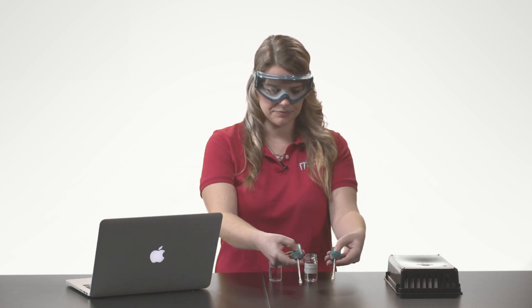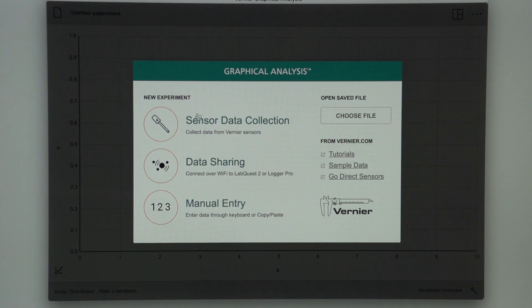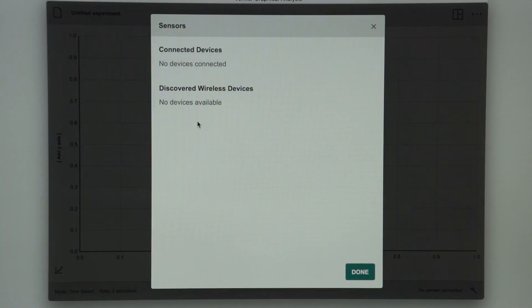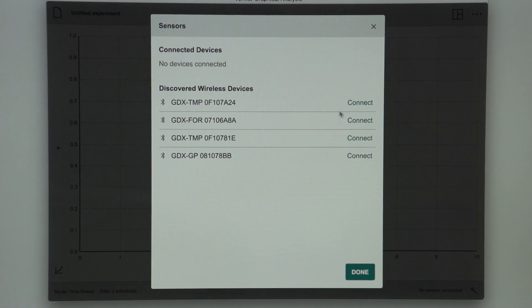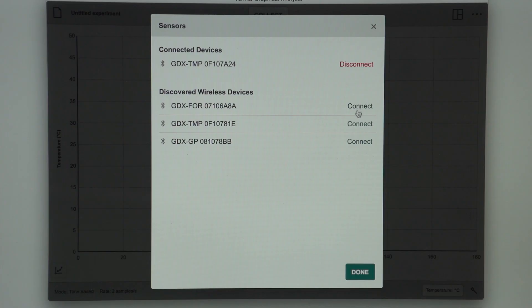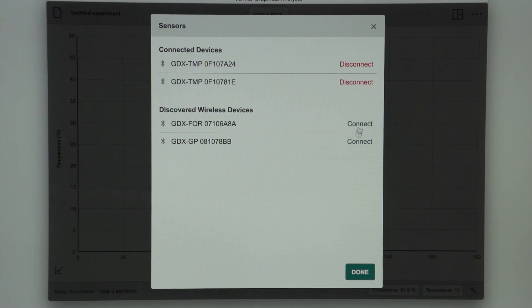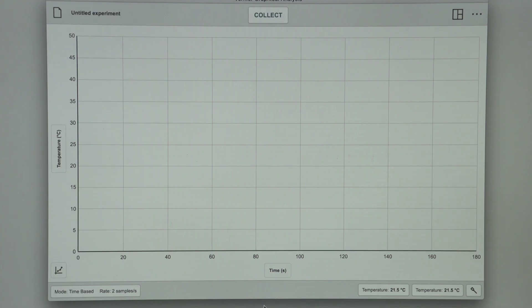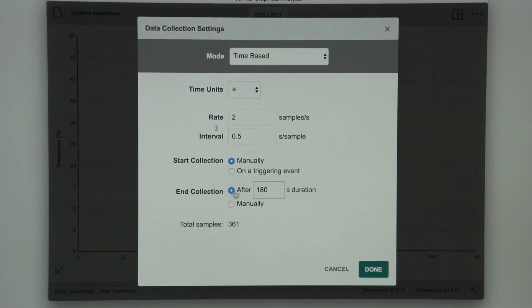Since I will be taking data via Bluetooth, I will first turn on my temperature probes. I will then launch my GA4 app and select sensor data collection. I will connect to my two temperature probes and press done. For this experiment, I want to change the duration to 300 seconds. To do that, I tap on the mode button and change the end collection time to 300 seconds, then press done.